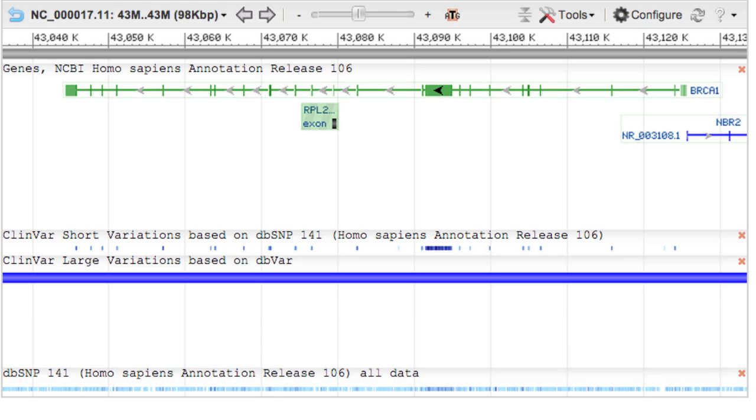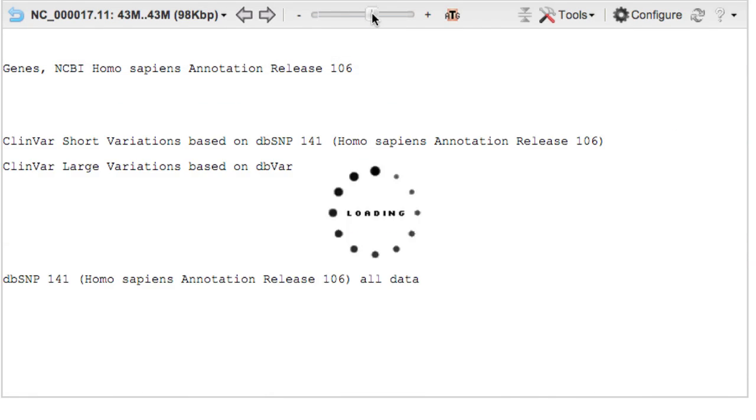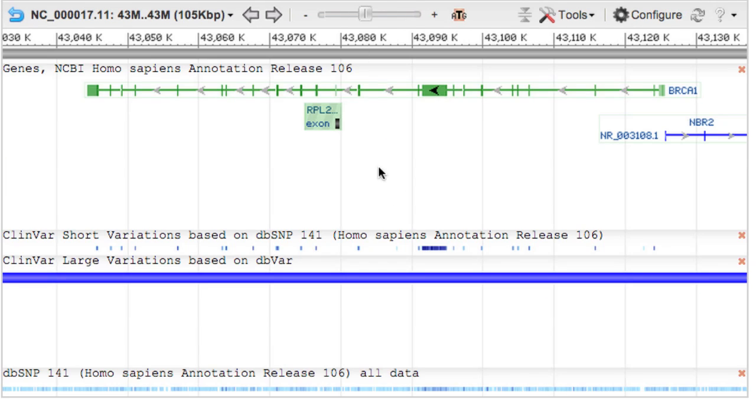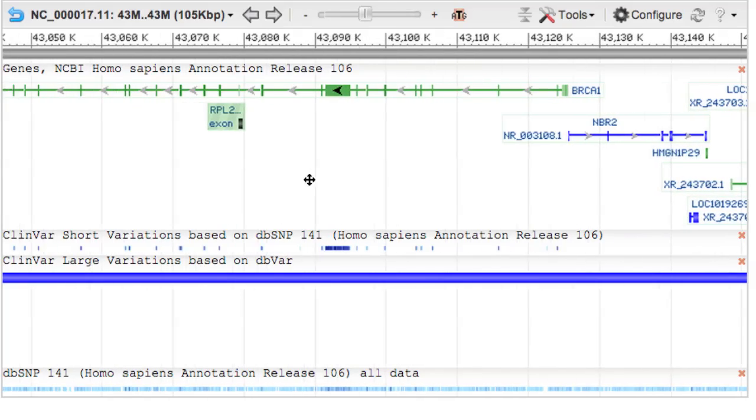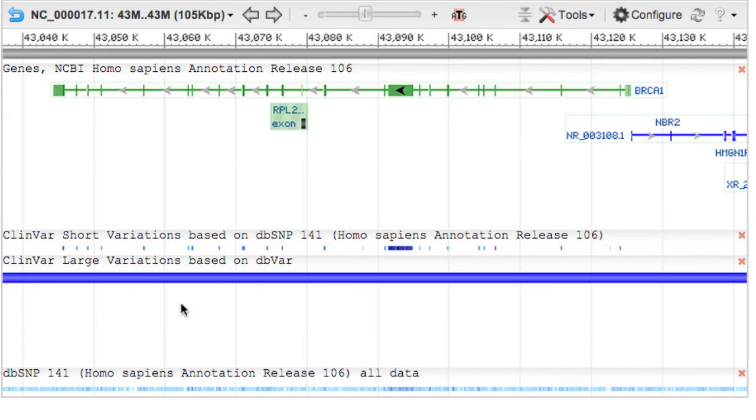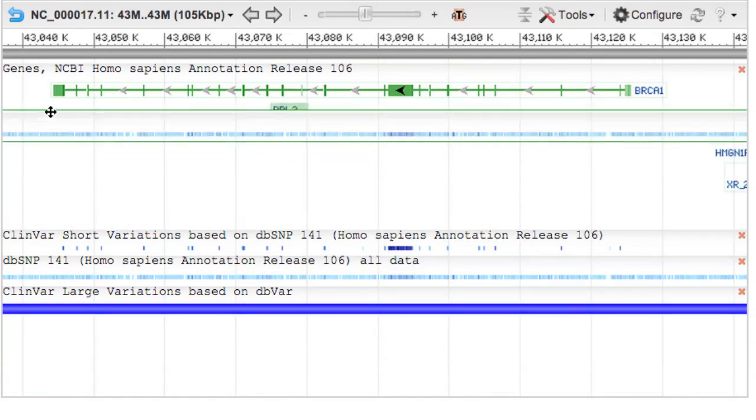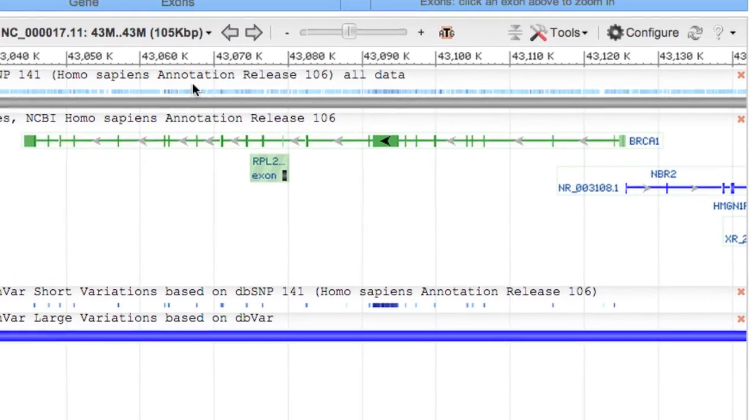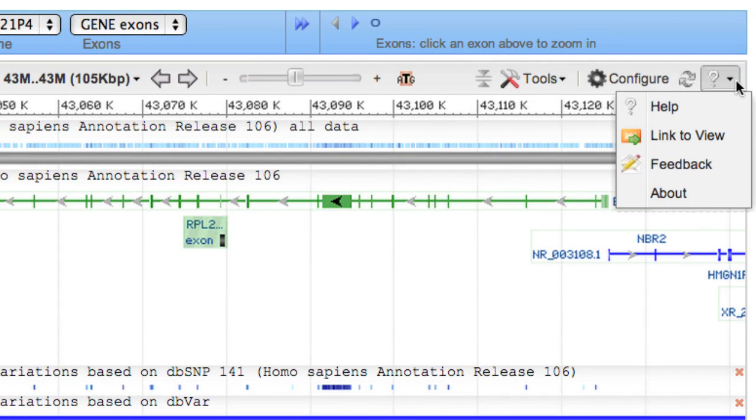Many other tracks and settings are available in the Configure menu. The Sequence Viewer allows you to zoom, pan, move tracks, etc. For more help, go to the Sequence Viewer documentation page via this help link.